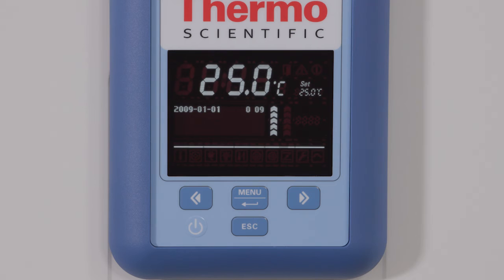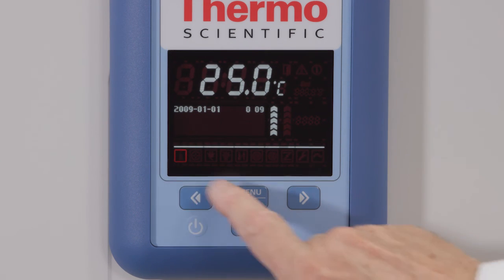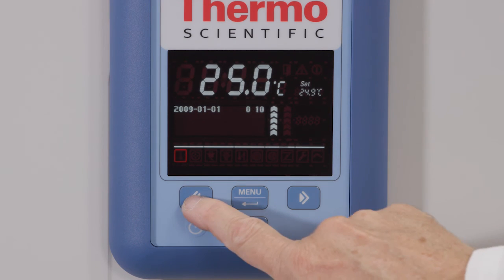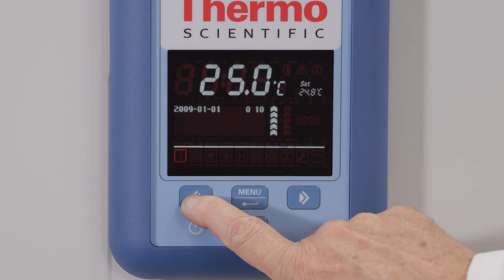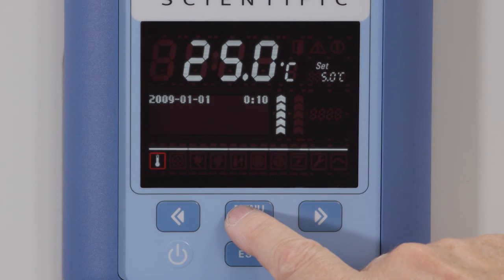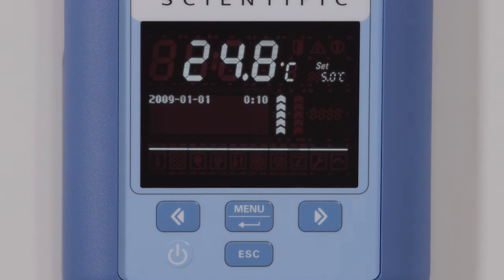As an example, we will set the temperature of our unit to 5 degrees C. Press menu to activate the menu bar. Then use the right toggle button to select the temperature icon and press menu to confirm. In the flashing setting pane, press the left toggle button to adjust the temperature down to 5 degrees C. Once the set value reads 5 degrees C, press the menu button to confirm the setting. The display will now return to the default temperature display.